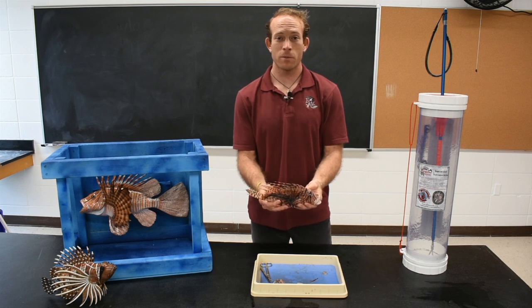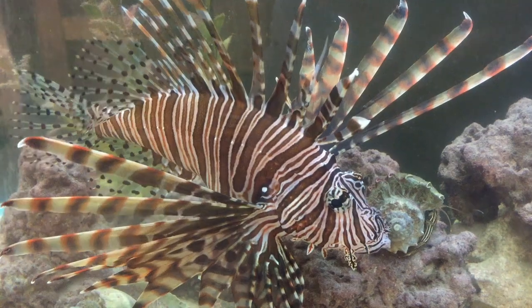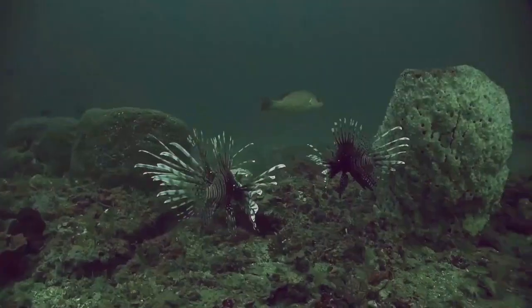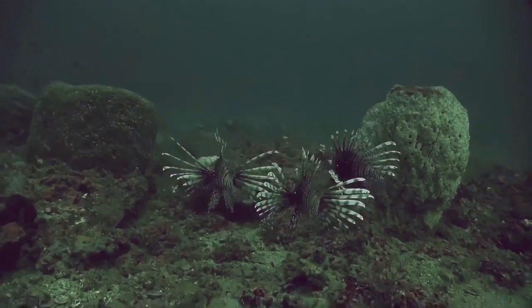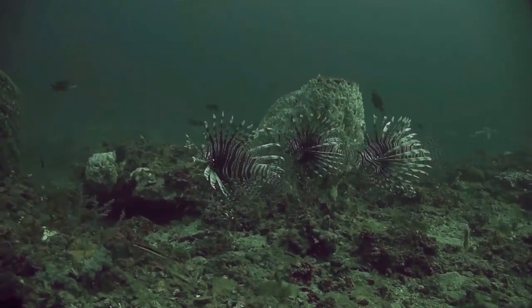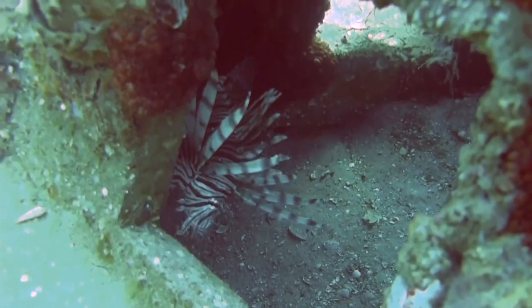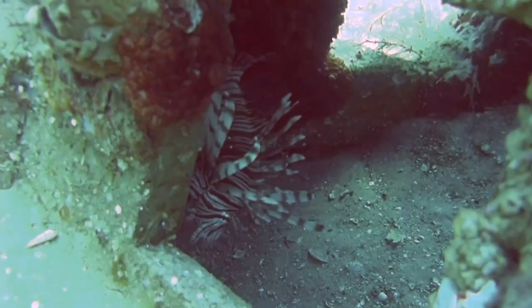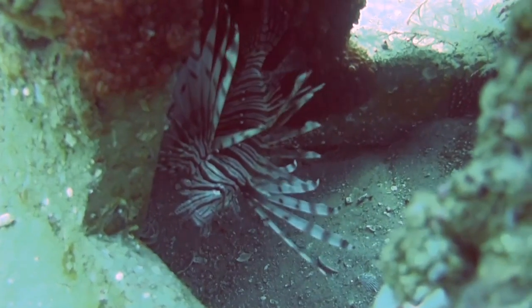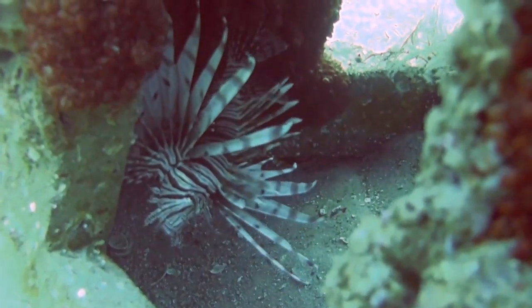First we're going to take a look at some of the external anatomy of the lionfish. You can tell important characteristics about a fish from its external anatomy — body shape and fin shapes can give you an idea of whether a fish is fast or slow, whether it prefers to swim in the water column or hide in tight places, and also gives you an idea of what kind of prey items it might target. The lionfish is a demersal species, so it prefers to sit on the bottom in sheltered areas, and it is an ambush predator that only moves in tight spaces for a short distance to attack prey items.